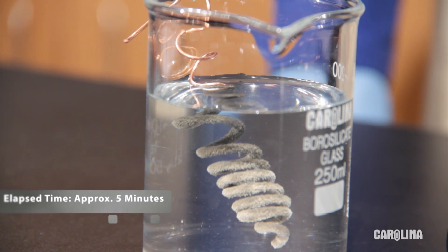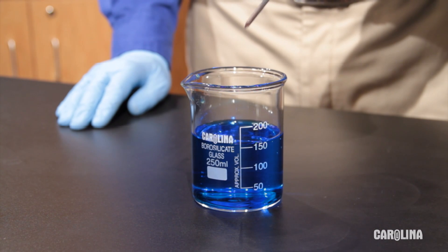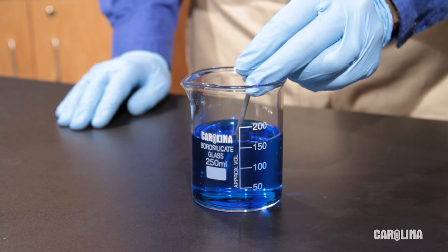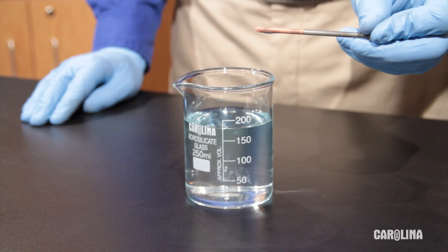Metal ions are good oxidizers. Copper ions, for example, will oxidize iron. Place an iron nail in a solution of copper sulfate. The copper will coat the nail and the solution will turn colorless. As copper plates the nail, the concentration of copper ions in the solution decreases and the solution turns colorless.